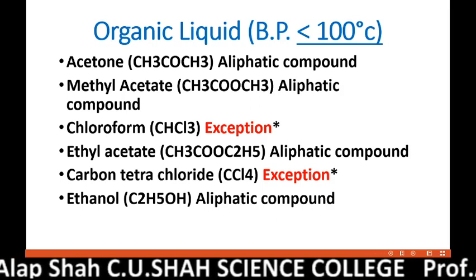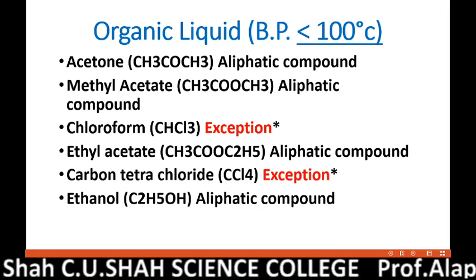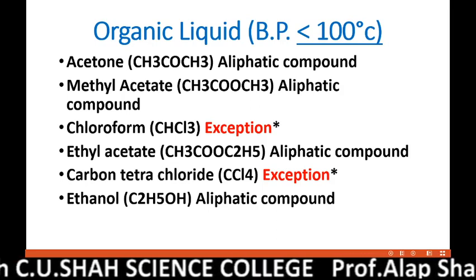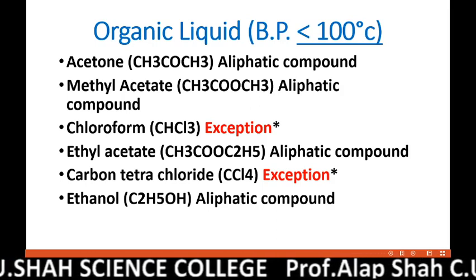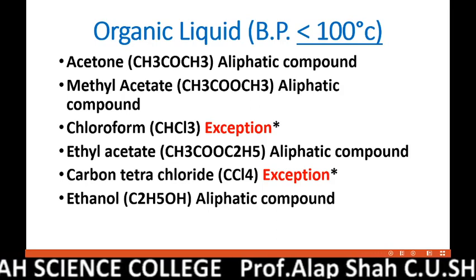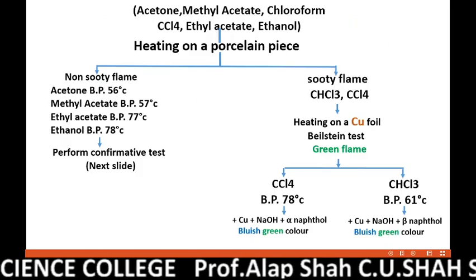All the liquids are neutral in nature. They all are aliphatic, but as you can see, chloroform and carbon tetrachloride are exceptional. They are aliphatic, but they burn with a sooty flame while porcelain heating. So let's see how we can distinguish between them.